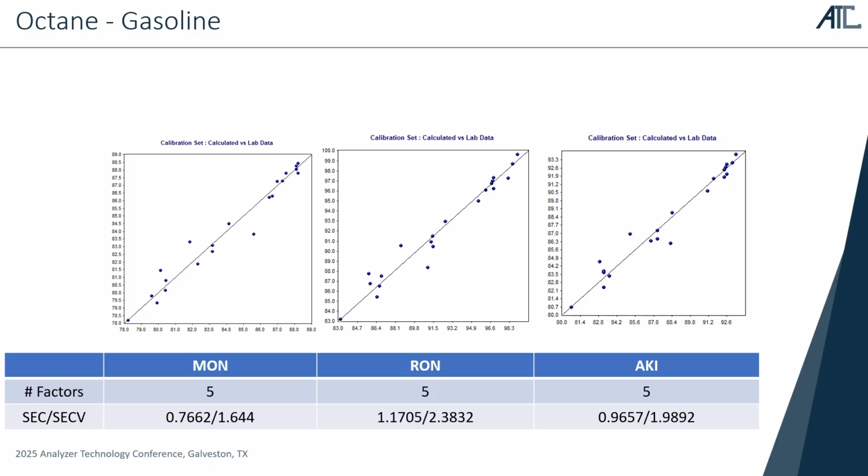And what is important with spectroscopy, if you look at those correlation plots, is maybe like you're used to perfect dots on a line. If we think about chromatography or something, in spectroscopy, it is more important how well it predicts in the end. We have to capture variation, and that's why the data turns a little bit more into clouds than perfectly aligned dots, but capturing variation helps us to build robust models.